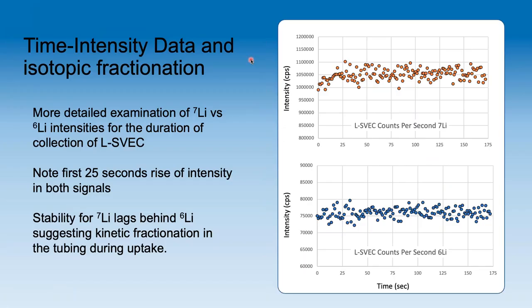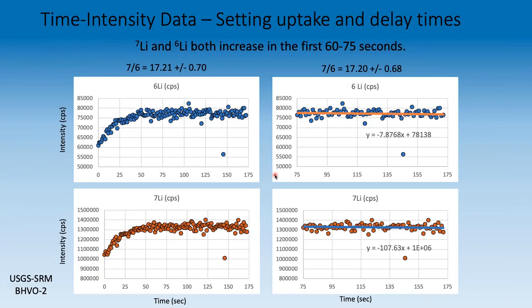In this case, it's probably not conserved quite as well, but to be sure, come on. Oops, spinning wheel of death, there it goes. To be sure, I would advocate for lopping off that ingrowth period, but you can use the whole thing. It really wasn't very different.